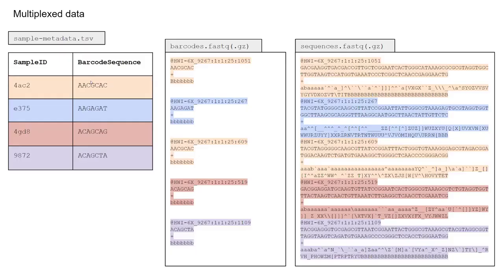Okay. Now that we have a better understanding of our FASTQ files, let's go back to our example data. So, again, here we have on the left our sample metadata file, which contains information about each of our samples, including their unique barcodes. In the middle, we have a FASTQ file for our barcodes. And on the right hand, we have another FASTQ file for our actual sequences. What is important to emphasize here is that, at this point, our data is still multiplexed.